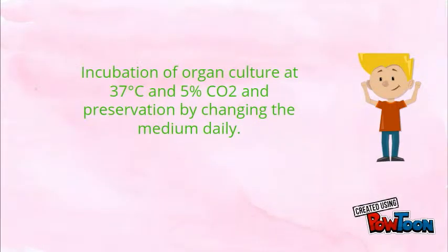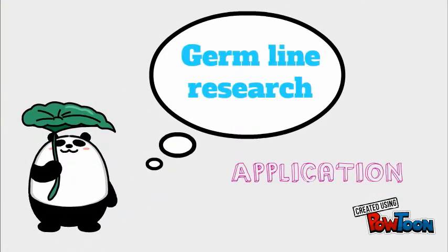Next, incubation of organ culture at 37 degrees Celsius and 5% of CO2 and preservation by changing the medium daily. The application is germline research.